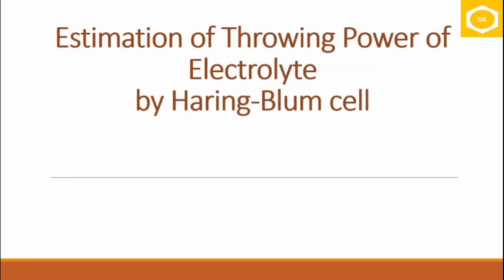In this video, we will learn the estimation of throwing power of an electrolyte or a plating bath solution by using Haring-Blum cell. For those who do not know the meaning of throwing power, you can watch my video number 2 in the series. Link for the video should be visible to you on your screen on the right top corner. Briefly, throwing power of an electrolyte can be defined as the capability of a solution to produce uniform deposition of metal on all sides of the substrate.